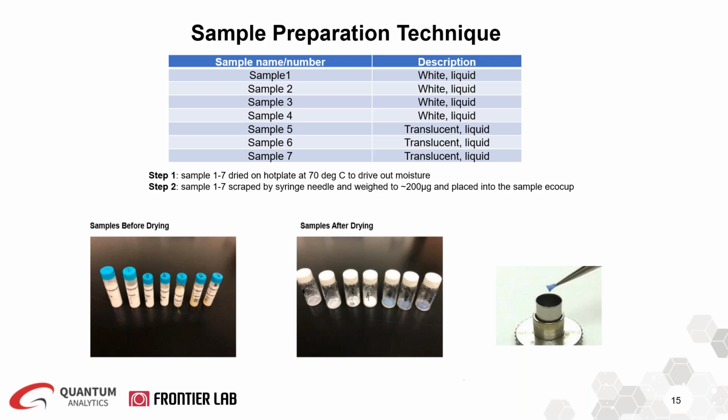To demonstrate how easy and quick sample preparation steps are in Pyrolysis-GC, I would like to show 7 samples which I received earlier last year and analyzed in the lab. The 7 samples are in liquid form. Some of them are translucent liquid.